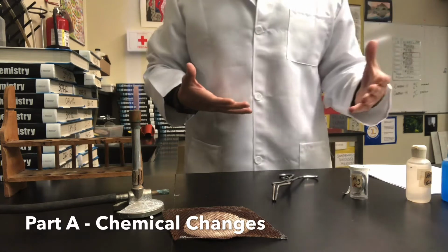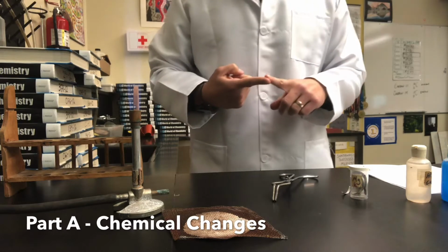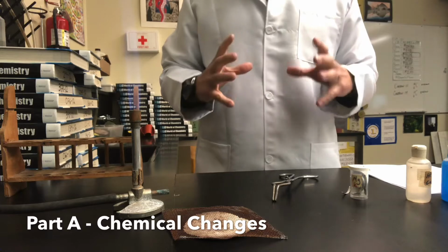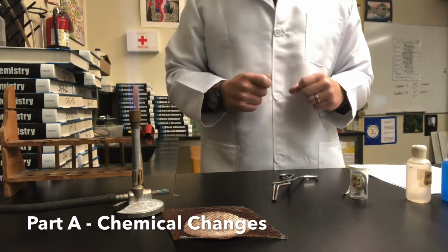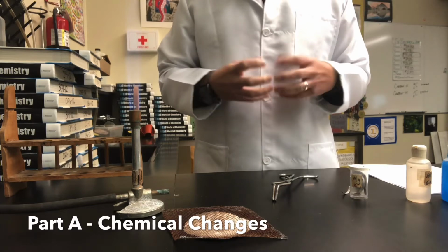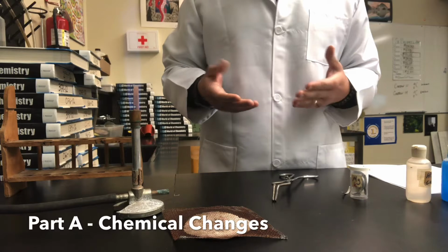Today we're going to be looking at a simple chemical reaction lab. When we're doing chemical reactions and looking for signs of them, things to consider would be: is there a color change? Could there be some type of precipitate forming? A precipitate is when liquids are mixed together and some new solid is formed inside of that. So let's be on the lookout for that.